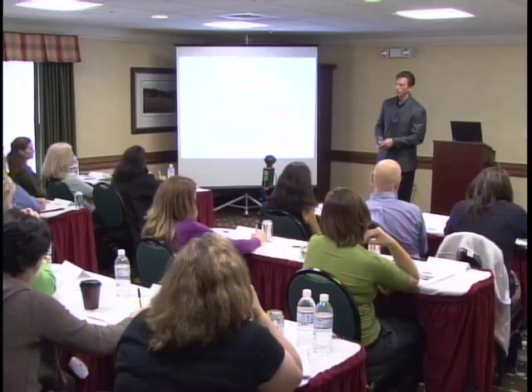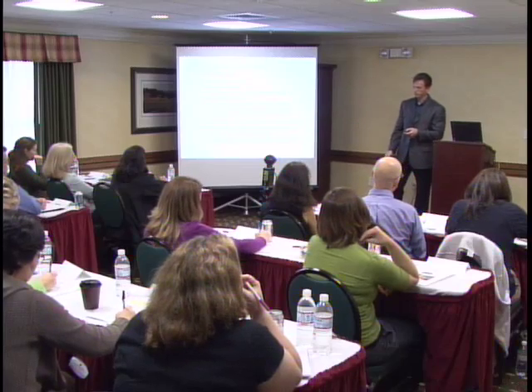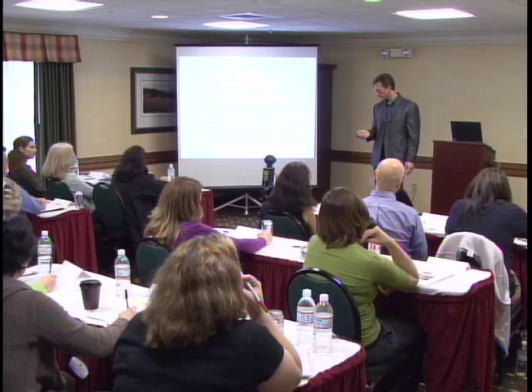We don't need to quantify, for instance, you just run. And with the mitochondrial assay, which is very similar in nature, goes through the same analysis, we've gone up to 37 nanograms per reaction without an apparent effect. But I can't answer that thoroughly because we haven't done that analysis.